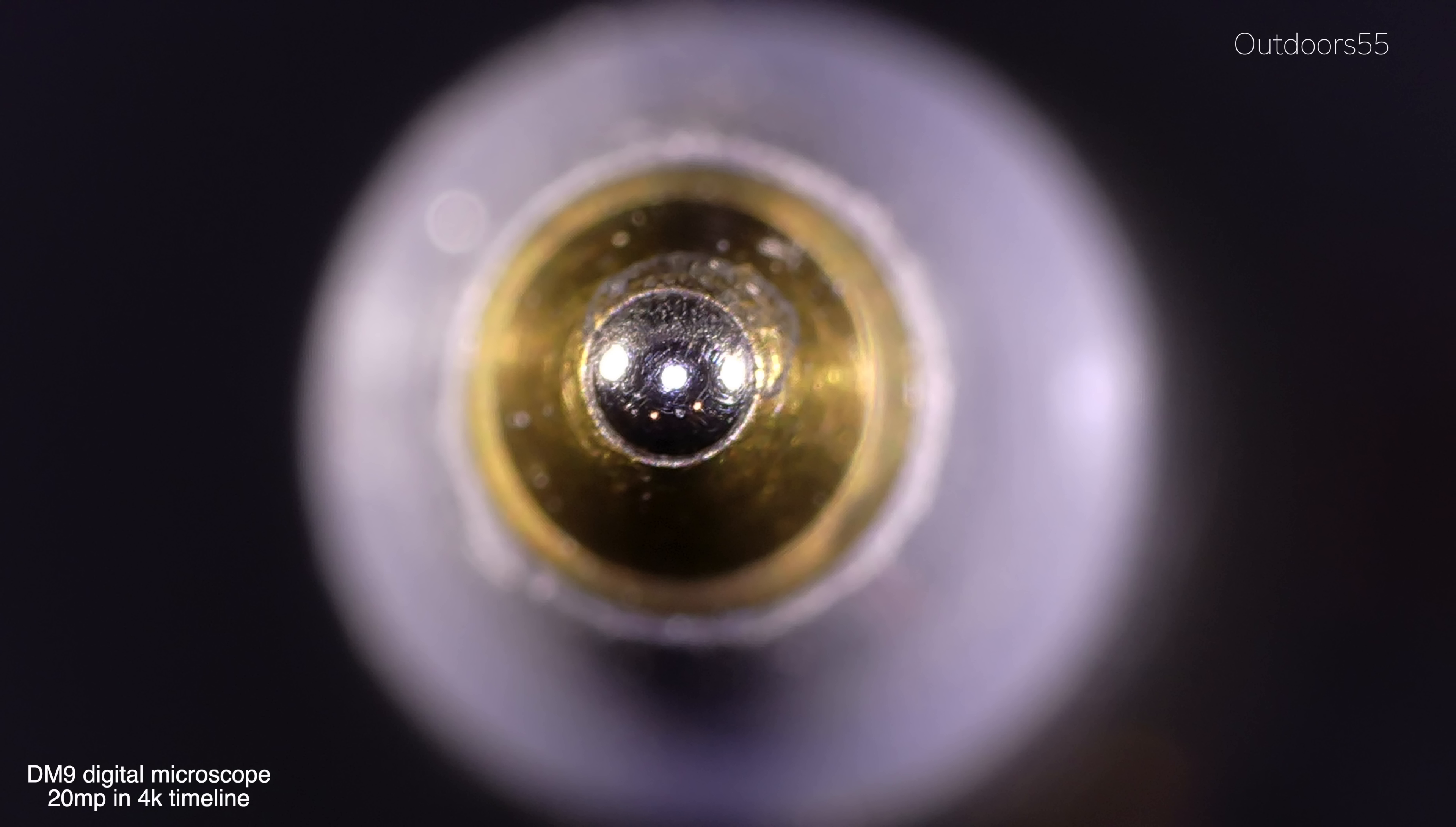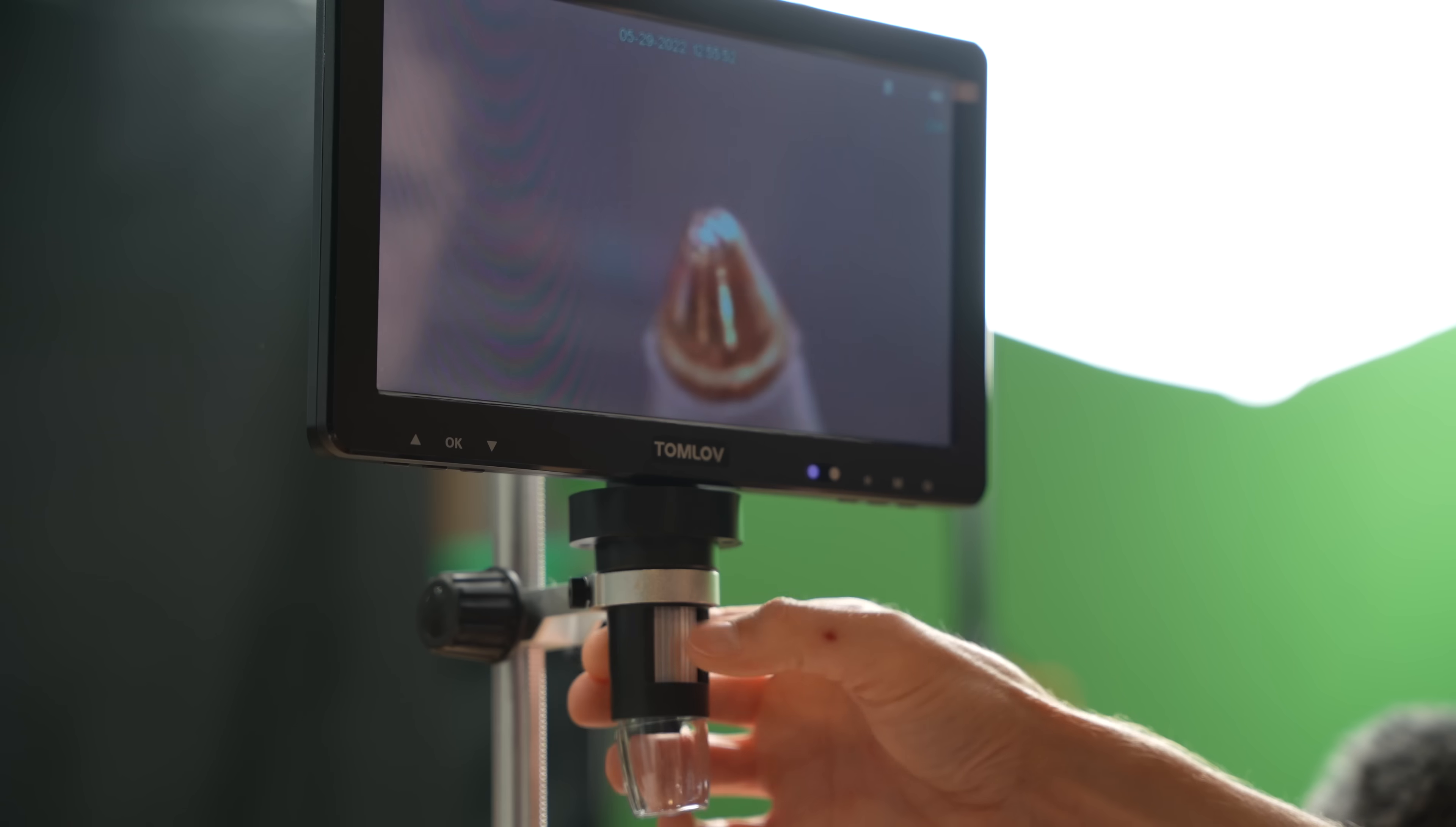So how they calculated this image from our Amazon microscope to be 1500x, the world may never know, but just like anything, the operator skill often plays a role in getting the best results, so I wanted to see if I could use my years of macro photo experience to improve on this original image. So because we now know that these digital microscopes are basically just cheap cameras projecting an image onto a screen, the question now becomes, how do we get the best image possible out of these cameras in order to get the highest magnification ratio?